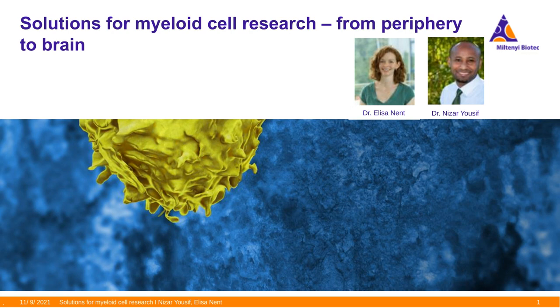Yeah, sure. So the imaging workflow, I also didn't really show it. I just showed it shortly in the beginning. Basically, you can image and analyze hemispheres or the whole brain.